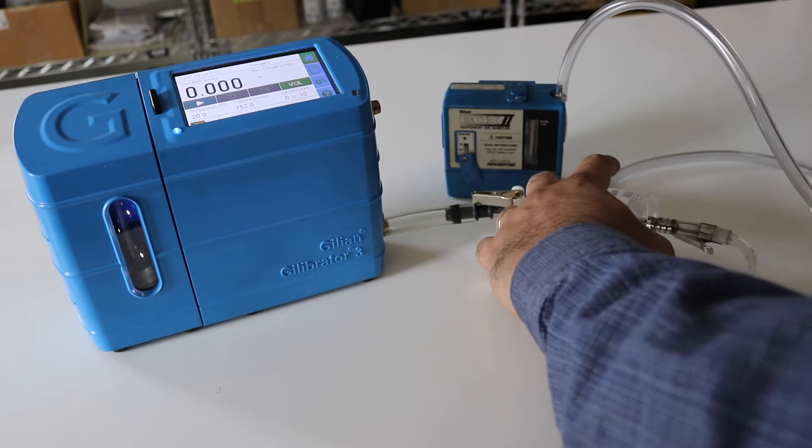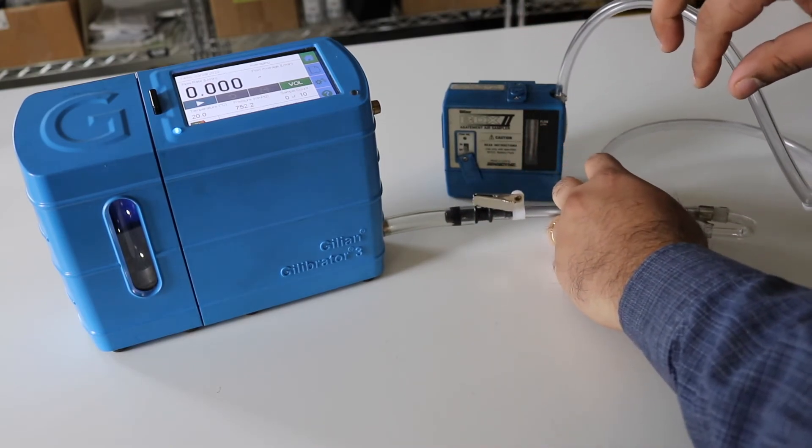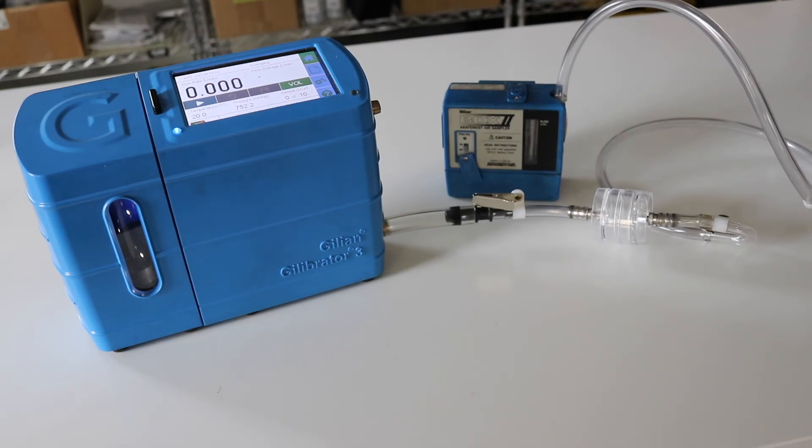Ensure that the filter side of the cassette is facing the sampling pump. The sample train should be set up using the same cassette and pump that will be used to collect your sample.